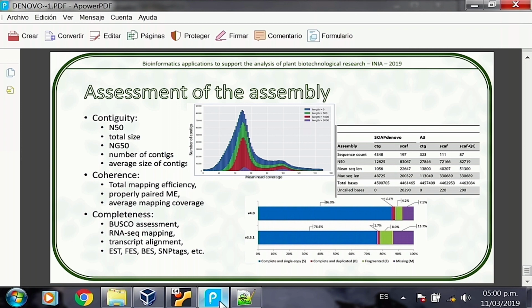Mapping efficiency is basically the percentage of reads from the total reads. Let's say you had 100 reads. If from 100 reads, only 30 map, that means you have a 30% mapping efficiency. How is it possible that only 30% of your reads map to a genome you just assembled with those same reads? You should expect something around 90% or 95% mapping efficiency.